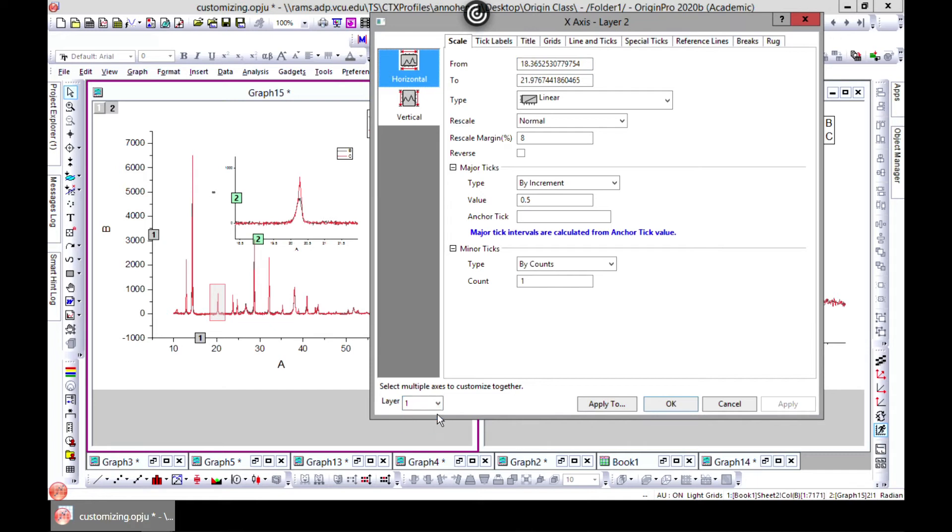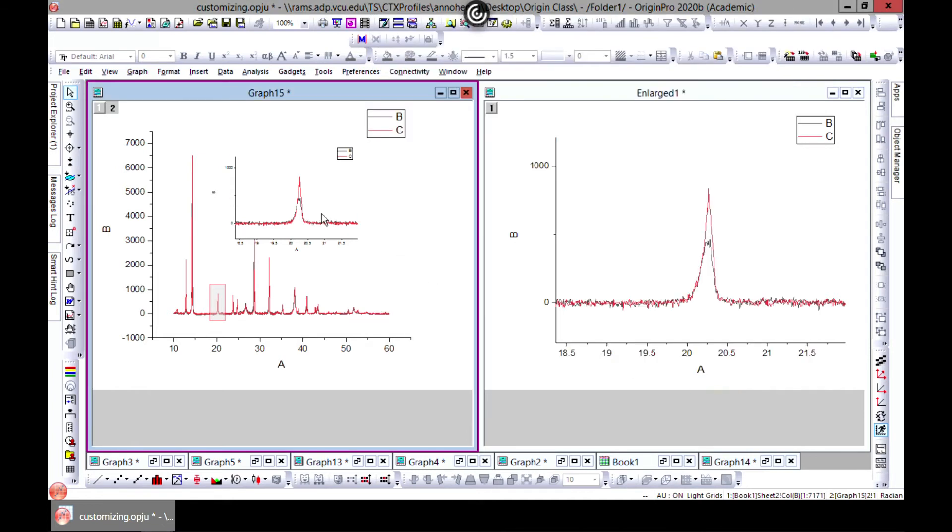If you go back to Layer 1, now you can edit your previous one. So it's something very interesting that you can do using Origin.